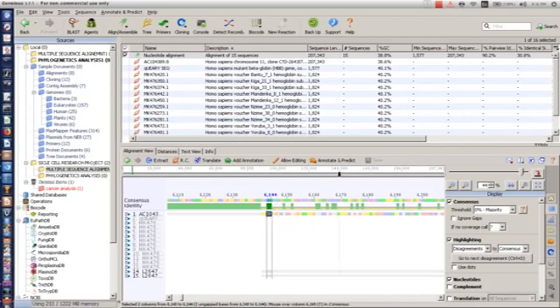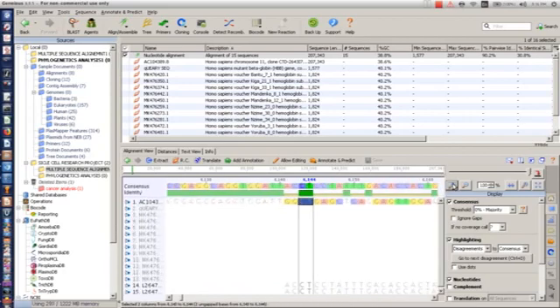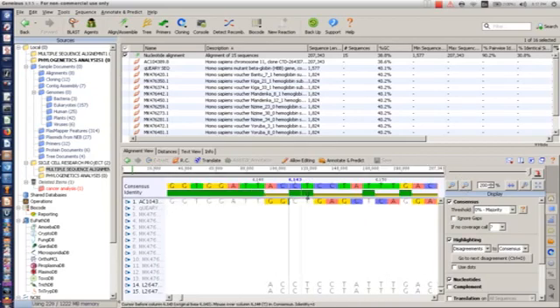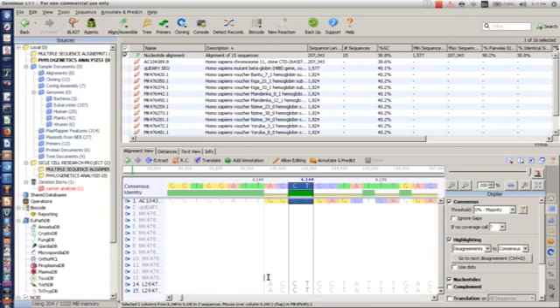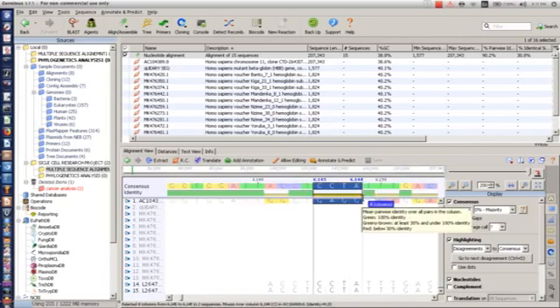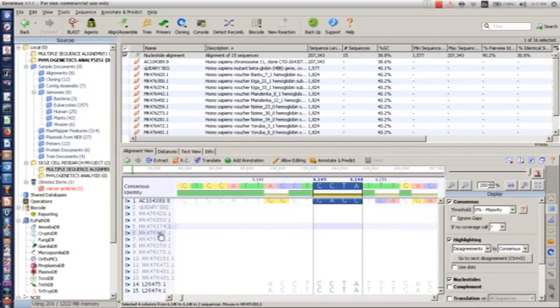So for you to just see, you can just zoom, so that means we have CTs. That means the whole of these regions carry CT, which is entirely all the sequences, so they all have CT here. So we have G, so that means the whole of this region here, there is a lot of differences. So that means only these two sequences actually carry the same nucleotide sequences. So every other one from here down to this, actually they are different. So that's why you see these differences.